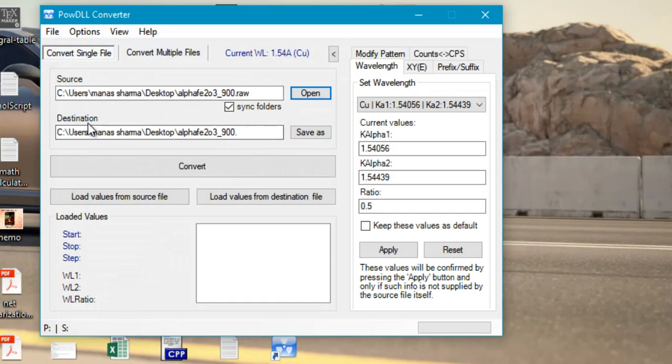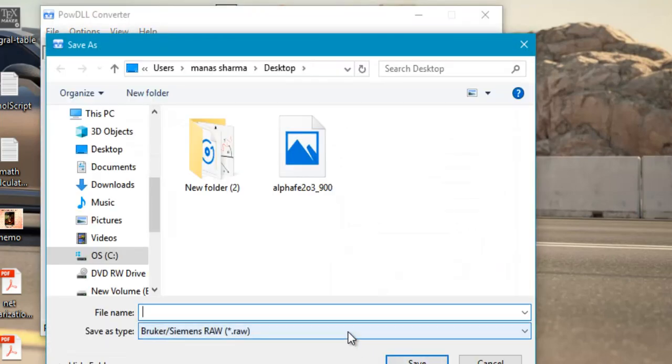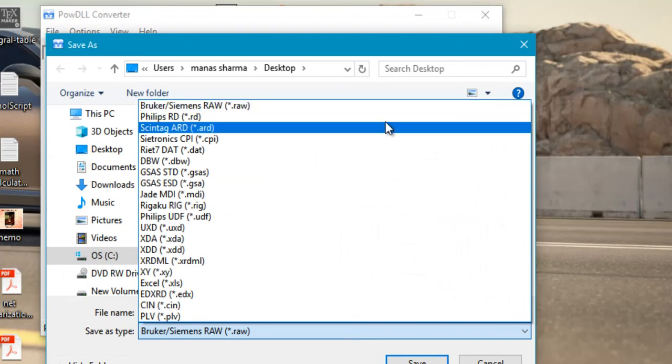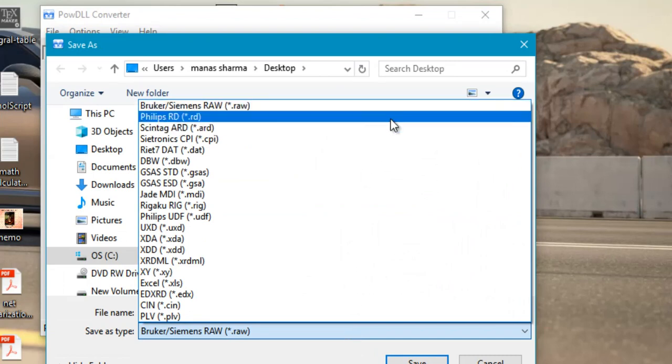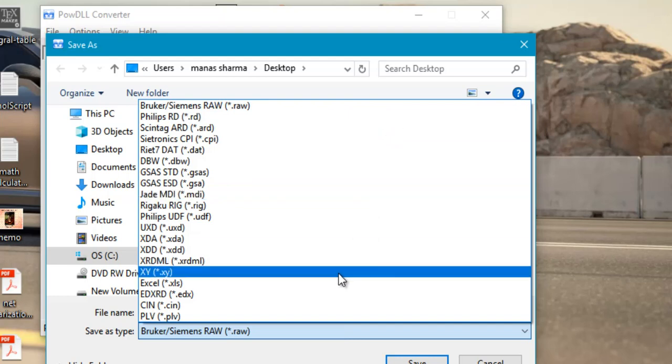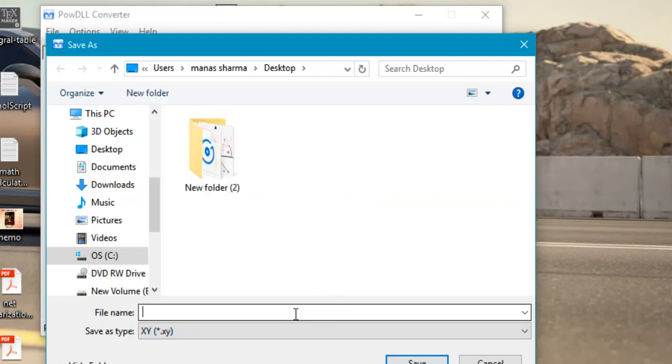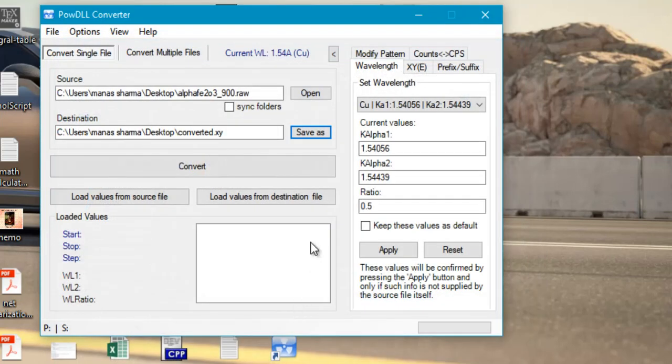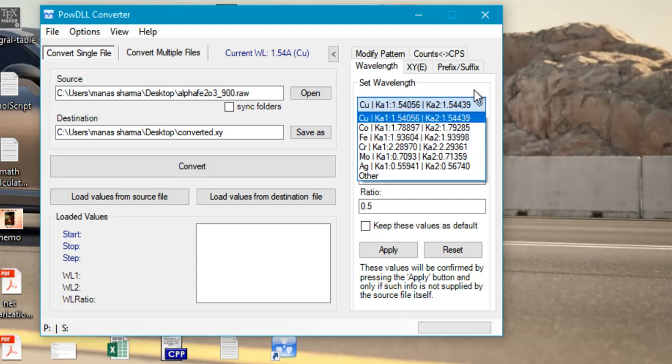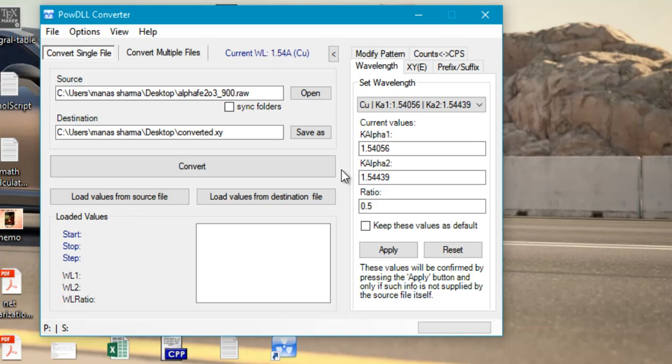Then you can also select the destination. Just go ahead and click on save as. Select the type of the destination file. Of course we are not going to convert it back to raw or any other unreadable format. We are going to select any readable format such as .xy or Excel. Let's just go ahead and select .xy and select a suitable name such as converted, then click on save. Now there are some other options such as you can choose the wavelength of your diffractometer and other important properties. I'll just keep them to default as they were the same for my diffractometer, then just go ahead and click on convert.